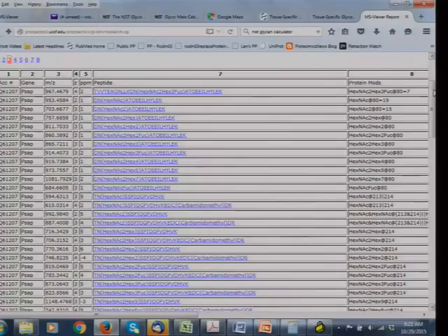Talking about the N-glycan proposed by the software, the number calculated or estimated must be really similar to the one calculated in the spectrum. When we are trying to guess the glycan, we get a number and then compare it with the number obtained by the software. And I saw that you try to get the most identical number. Yes, it should be.